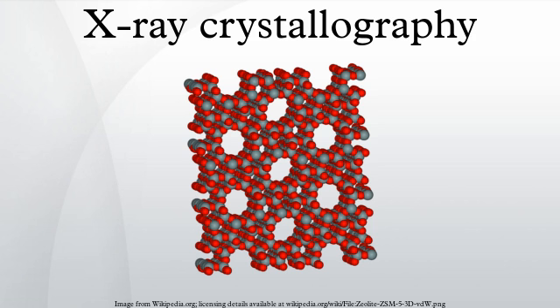X-ray analysis of crystals. Crystals are regular arrays of atoms, and X-rays can be considered waves of electromagnetic radiation. Atoms scatter X-ray waves, primarily through the atom's electrons. Just as an ocean wave striking a lighthouse produces secondary circular waves emanating from the lighthouse, so an X-ray striking an electron produces secondary spherical waves emanating from the electron. This phenomenon is known as elastic scattering, and the electron is known as the scatterer.